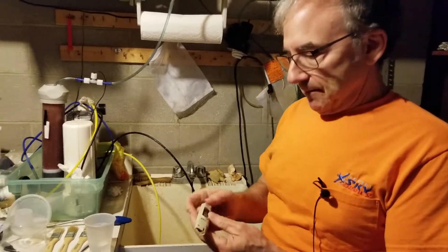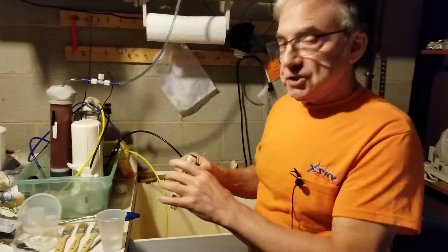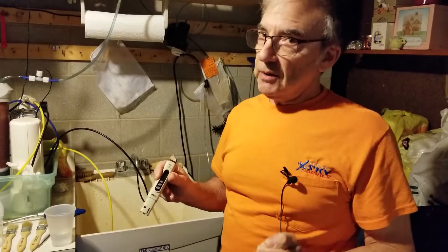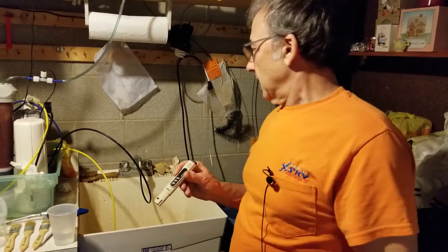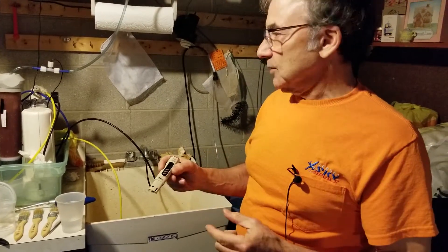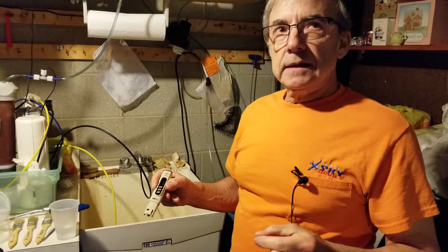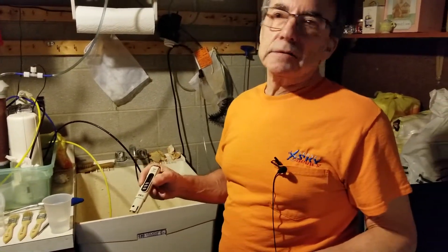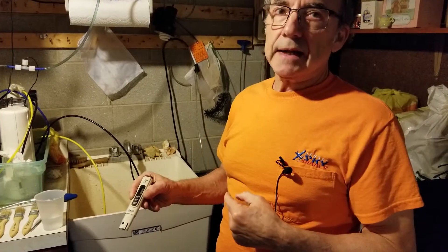The instrument comes pre-calibrated from the factory and they say you don't have to calibrate it. What I'm going to do next is measure the parts per million — total dissolved solutes — in the water coming straight out of the faucet.